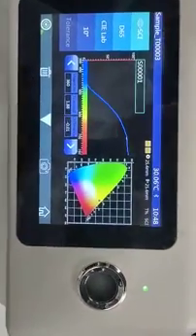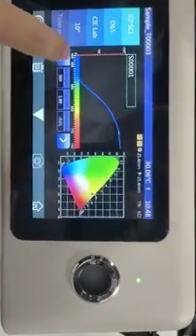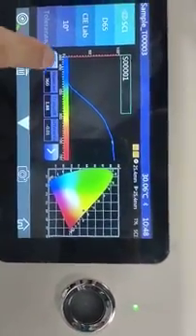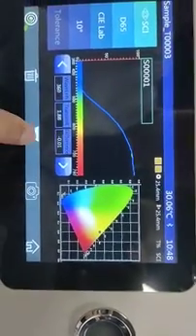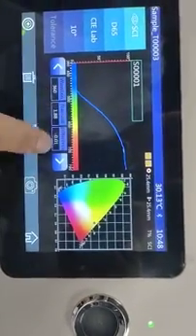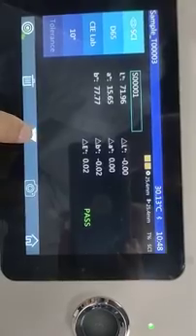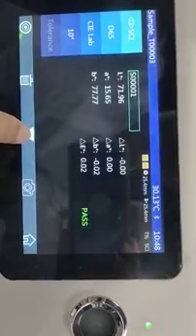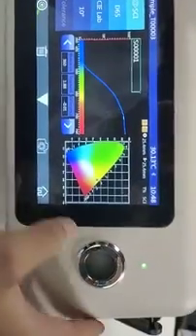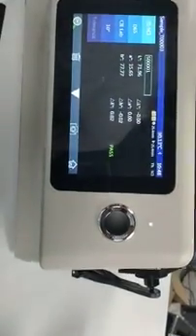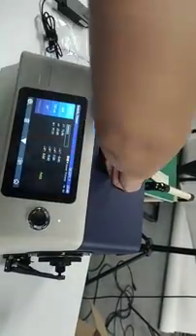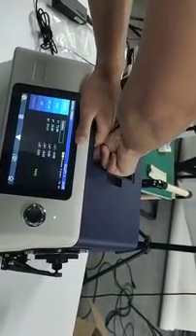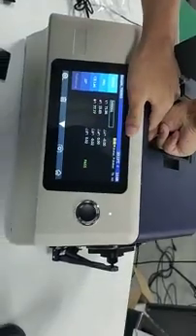Ok. Measurement done. This is the reflectance. Reflectance. Reflectance. Reflectance. Ok. There's another big function. I need to show. With the haze. Haze. Haze measurement.